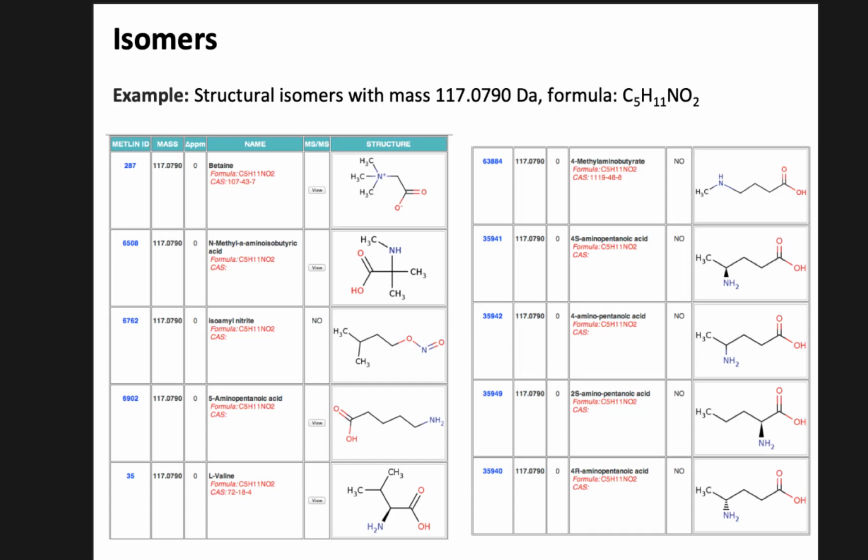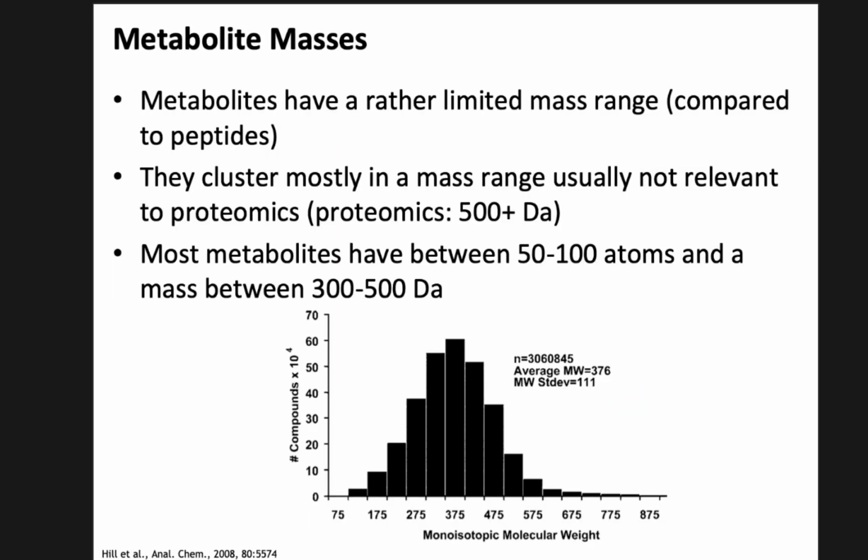When we look at the overall distribution of metabolites, note that these were organic molecules. These were not necessarily metabolites. These are all of organic chemistry. That's what's in PubChem. When we look at metabolites or known metabolites, compounds that have been annotated as metabolites, I should be a bit careful because we really don't know what the metabolome is. If we look at these known masses from databases, then this is what it looks like.